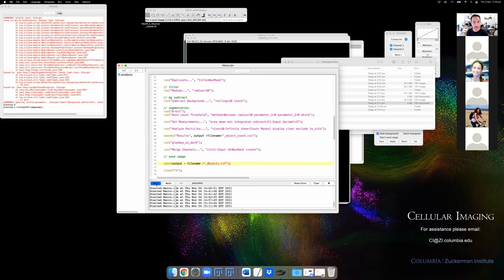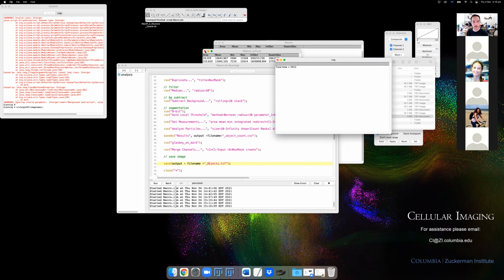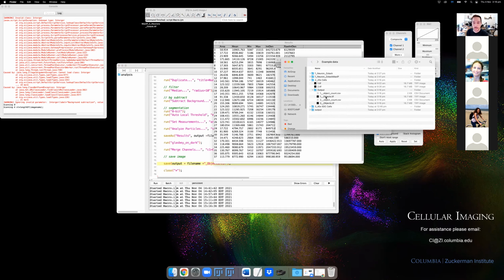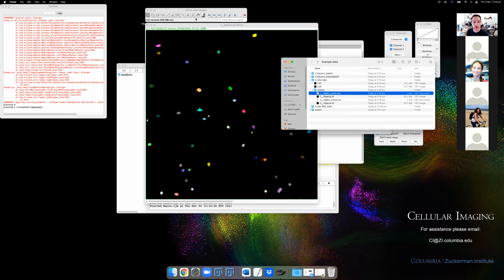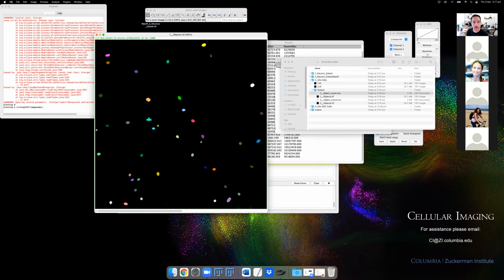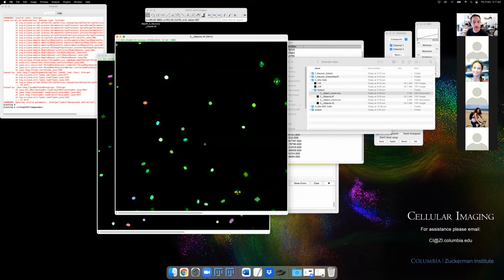So let's just try this again. I'm going to make this a bit bigger now. I think this was too fine. Okay, so this is our first image. We open it up. Second one. Yeah, we need to fix that background subtraction, but otherwise it's working.